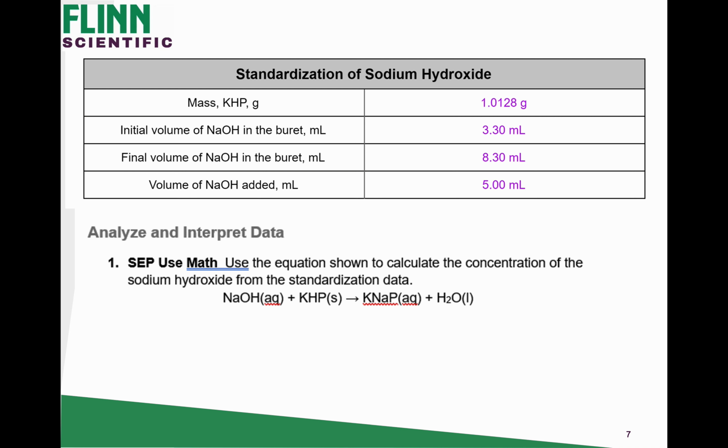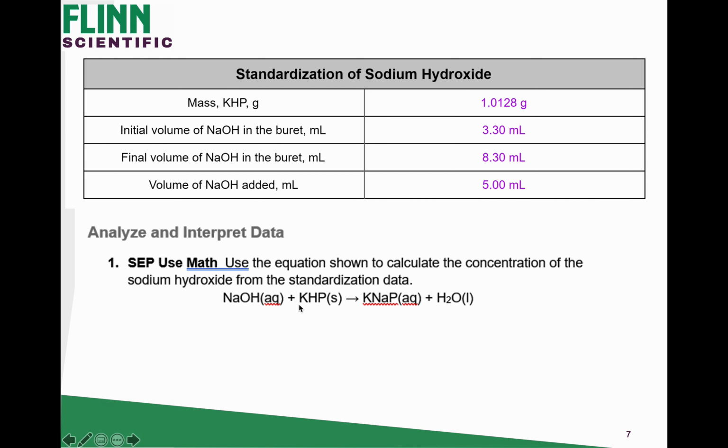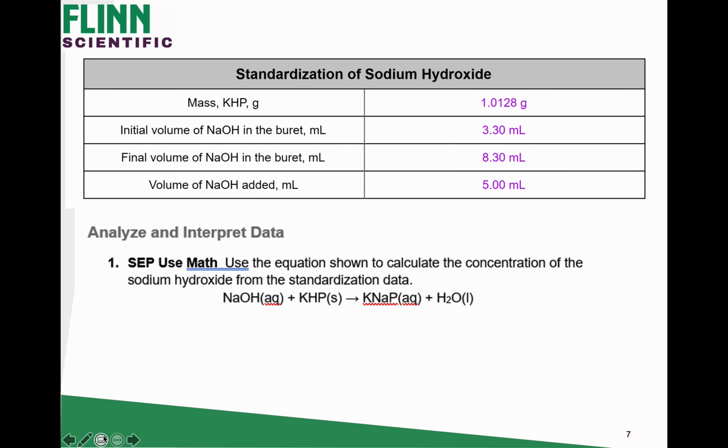from the standardization data. Now, I do want you to pay attention. Notice that they are calling it KHP.